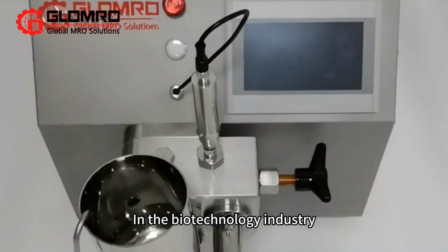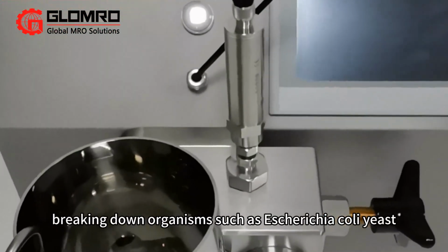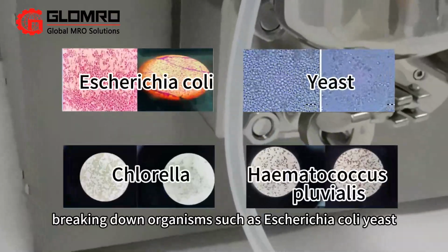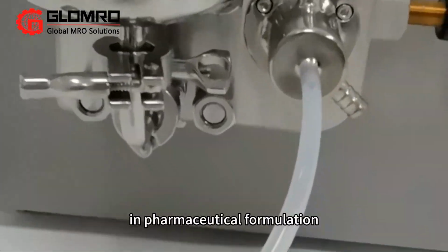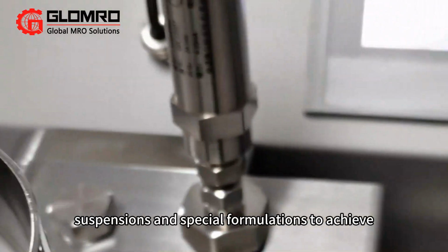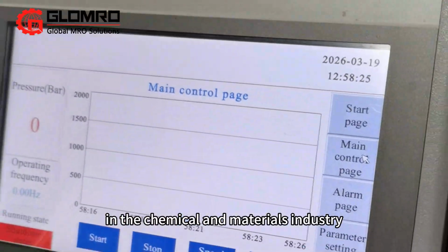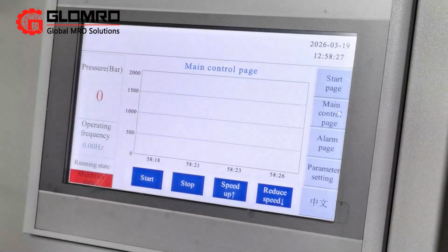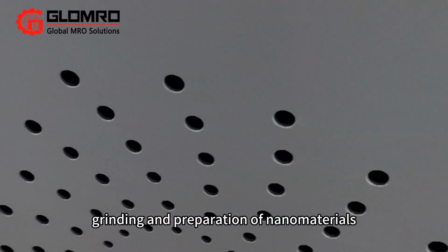In the biotechnology industry, high-pressure homogenizers are used for breaking down organisms such as Escherichia coli, yeast, chlorella, and Haematococcus. In pharmaceutical formulation, they are applied in preparing emulsions, suspensions, and special formulations to achieve controlled particle size and uniform emulsification. In the chemical and materials industry, they are utilized for dispersion, delamination, grinding, and preparation of nanomaterials.